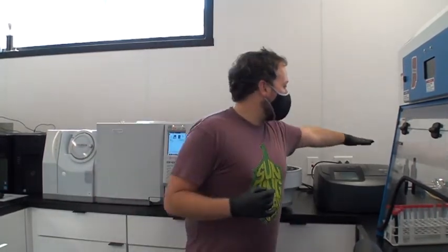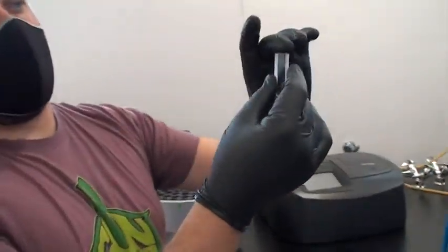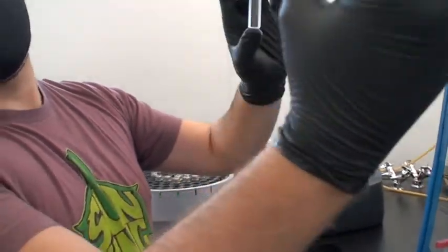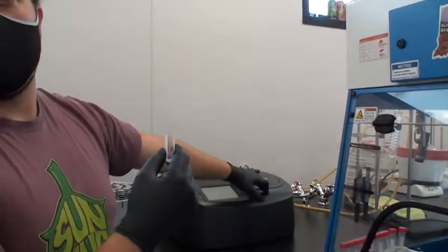So you just put a sample of beer in the cuvette? Yes — for color testing, that's the easiest: you put a sample in, measure it at a specific wavelength, do some math, and there's your SRM. Darker beers require dilution because they're too dark for light to pass through. Light shines through the sample at a specific wavelength, and once it hits the sample it'll either be absorbed or pass through.